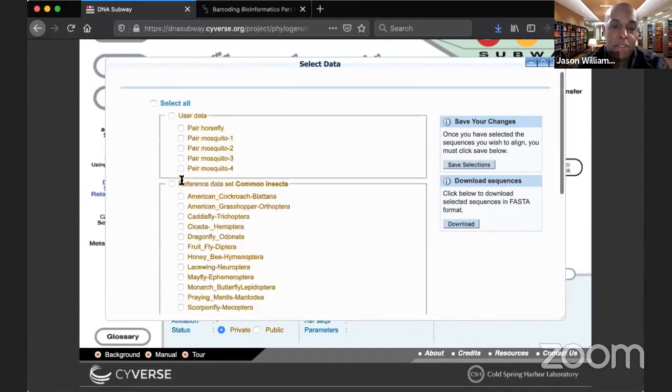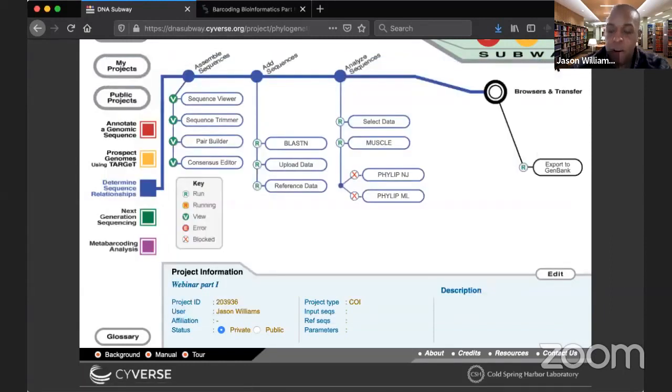So we should be able to believe that these are some data sets that we could use in a few moments. And what you have the opportunity to do, as we're going to be building, and I'm going to introduce now the topic of multiple alignments, is you can choose and go back and reselect and re-choose and shuffle things around. We're going to make use of that in just a moment, but let me go ahead and share this information on multiple alignments, and we'll come right back to this. So I'm going to go back to my slides.